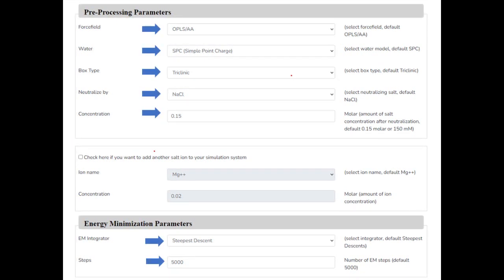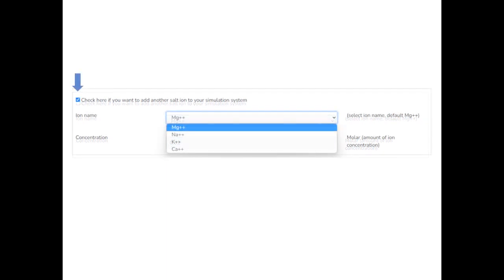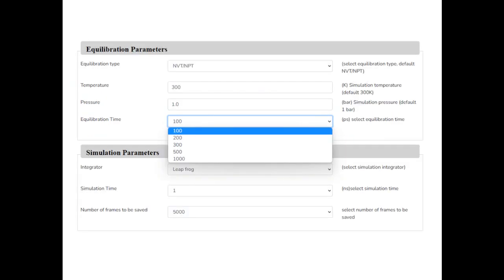Some simulation systems require additional salts to be added. If you want to add a second salt to your system, please check the box that says check here if you want to add another salt ion to your simulation system and add the salt details, including the concentration.